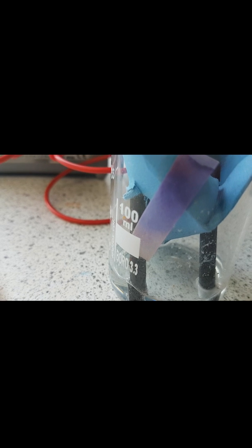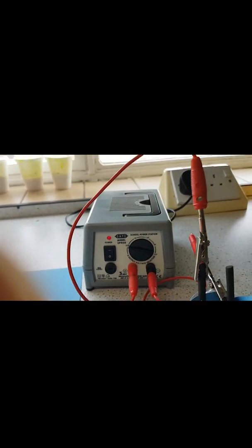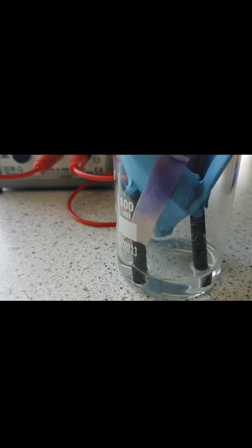The litmus paper turns a reddish colour and the bottom end turns white — it's being bleached. This is a positive test for chlorine: a damp blue litmus paper turns red and then bleaches white. We now know that chlorine is gathering at the positive electrode. The question is what's happening at the negative electrode.